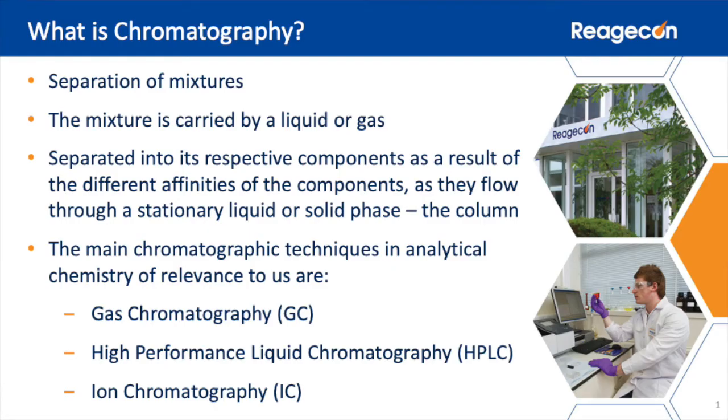Chromatography is the collective term for a set of laboratory techniques used for the separation of mixtures. The mixture, in other words, the sample, is carried by a liquid or gas and is then separated into its respective components as a result of the different affinities of the components as they flow through a stationary liquid or solid phase known as a column.